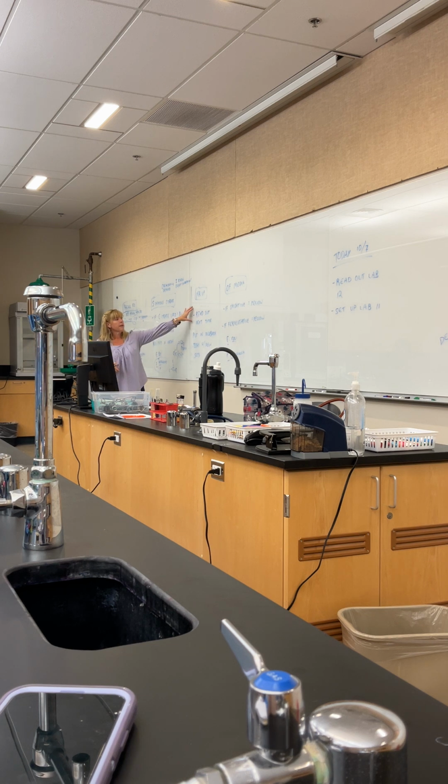Okay, MRVP. We're going to read that guy out next time. So I want you to take your MRVPs, put him to the side. He's going to go back in the incubator with your proteins today. All right? Do not throw them away. Make sure you can put them on your racks that have your stocks that we're going to set up today if you want to make sure we don't lose them.